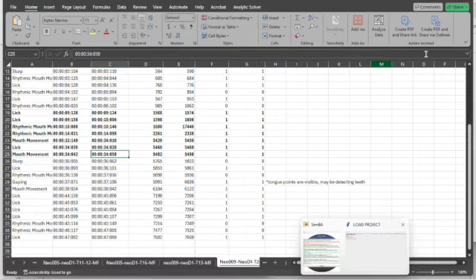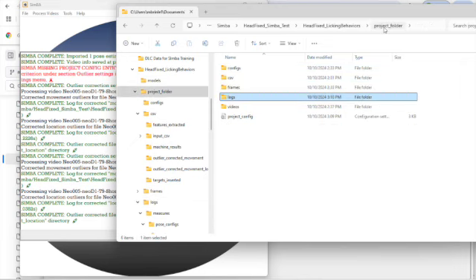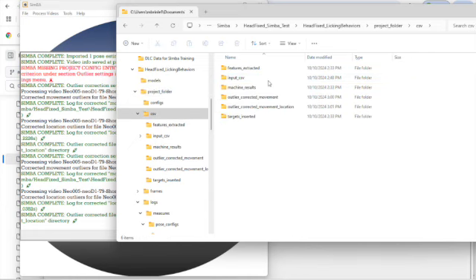Similarly, you'll get that for the location correction. I won't open that right now, but it gives you similar output. And usually there are even fewer corrections in that because it corrects for movement first and then location. You can also see the corrected CSVs. I had a problem where I initially gave it two points that were very close together, so it was essentially saying that all my other points were incorrect and removing a bunch of data points.